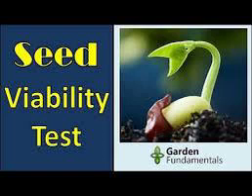Rapid assessment of viability: Tetrazolium test. In addition to the germination test, the Tetrazolium test is most widely used to measure seed viability. It is a biochemical test developed by a German scientist, Georg Lakon, in 1942. It distinguishes between the viable and dead tissues of the seed embryo on the basis of dehydrogenase enzyme, respiration enzyme, activity.